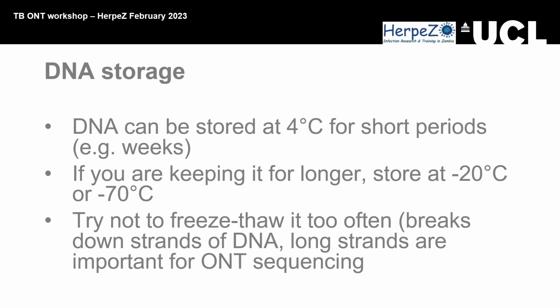Does anybody have any questions? I think a lot of you do CTAB anyway, don't you? The ones from the TB lab. Yeah. Do you use tRNA? I don't think it's a commonly used thing, to co-precipitate. Yeah, no, I don't really. For cell sequencing. Yeah. Okay. Quite similar.